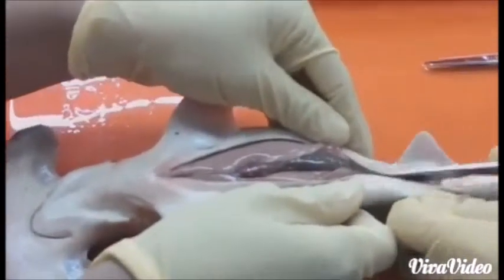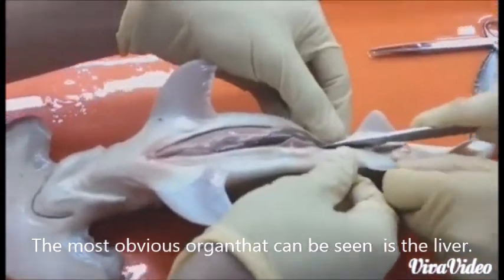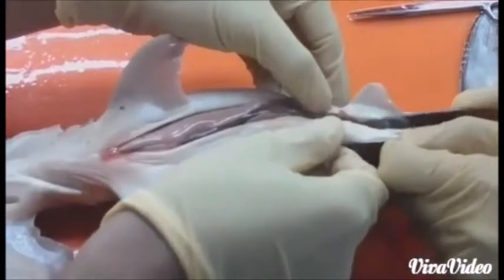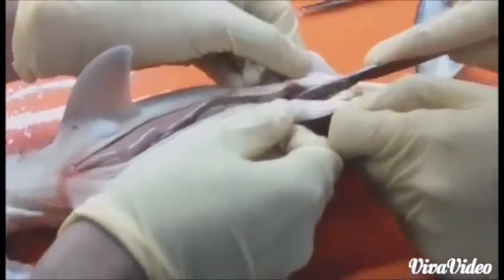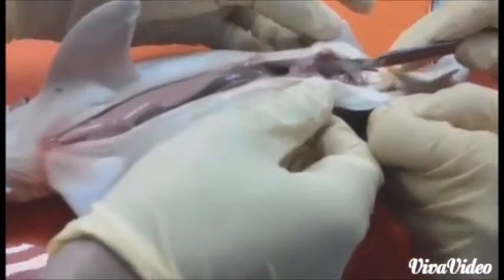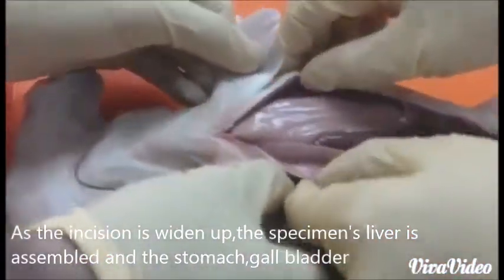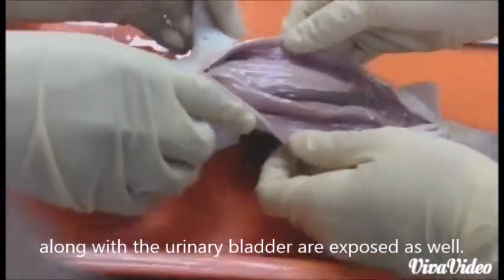The most obvious organ that can be seen is the liver of the specimen. It is pinkish and slightly yellow. As the incision is widened up, the specimen's liver, the stomach, the gallbladder, along with the urinary bladder, are exposed as well.